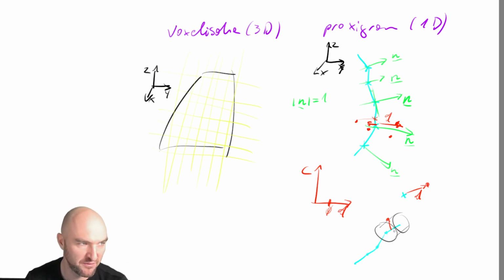And we're providing functions actually for all of that. So you can do lines, points is trivial, you don't need a function for that. It's just the Euclidean distance to the point.